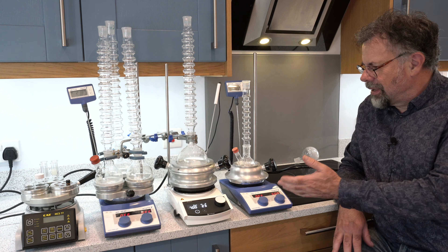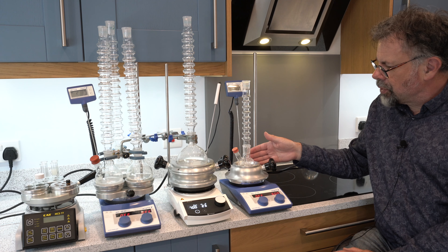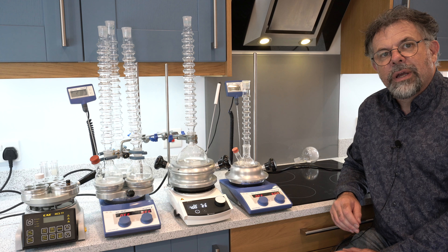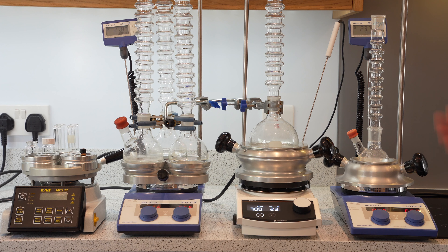Let me start at this end and show you this product first. This is the Scholar, and Scholar allows experiments between 50 millilitre round bottom flasks up to 250 millilitre round bottom flasks in a single experiment.